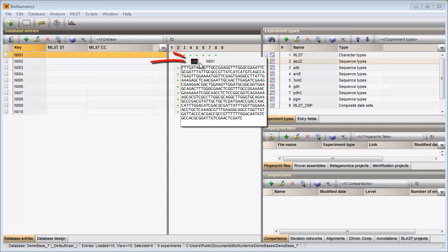The assembly window can be called by clicking on this button. To close the card, I need to click in the upper left corner of the card.